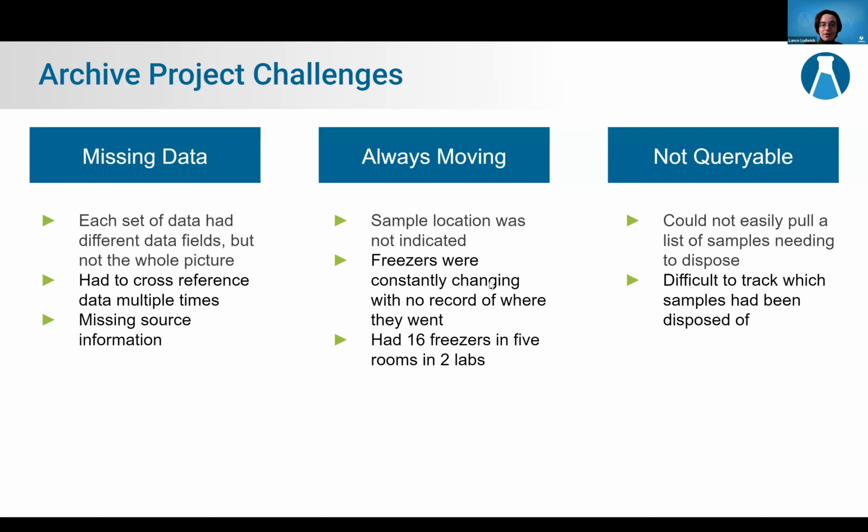And now, after about a month of me working on this project that took well over a year of me going through freezers, I learned about Sample Manager. And I was amazed how all of these problems could have been addressed with the software. If I had Sample Manager, this project would have taken me well over a year down to weeks, or even just a couple of months with just the large volume I had to go through.